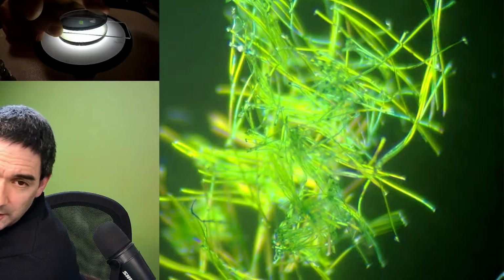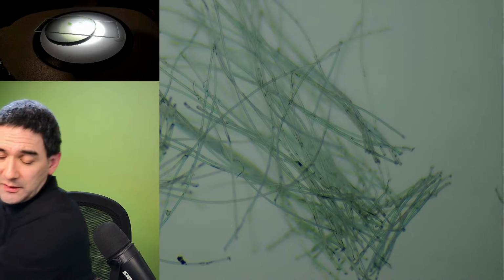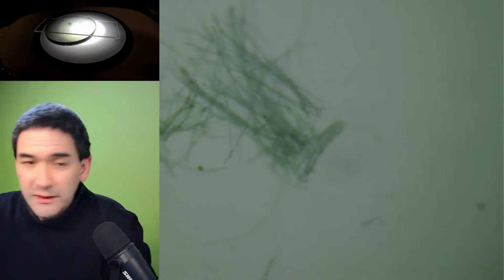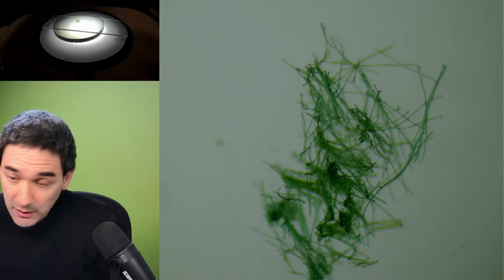Okay, you get the idea, right? And this one over here is the white one. So let's zoom out again a little bit. This is basically something that I also tried to do. I can show you later what I've done.